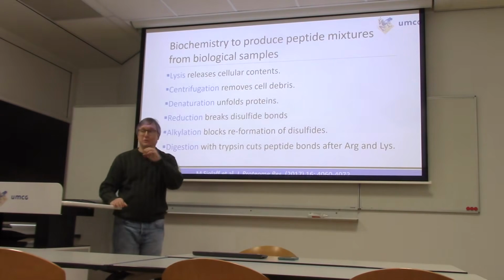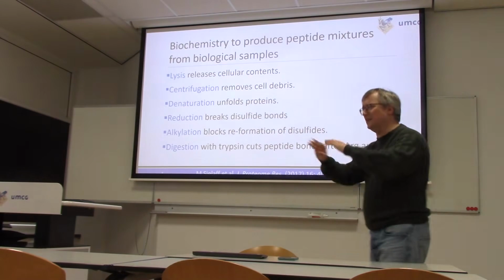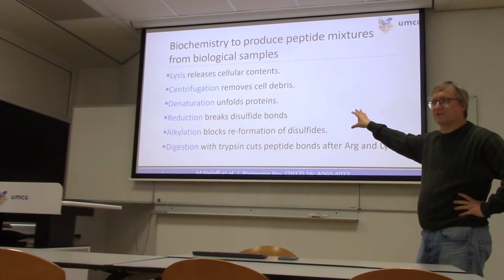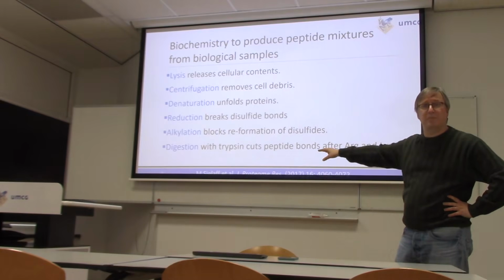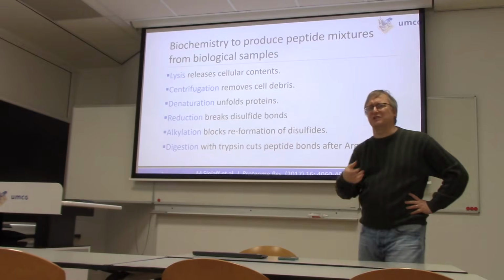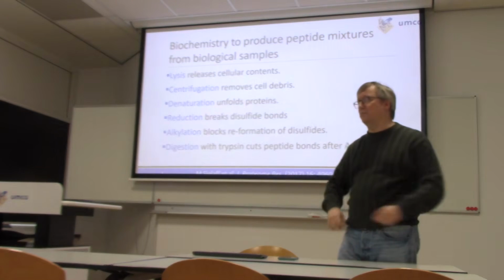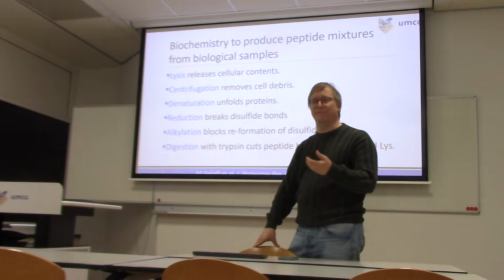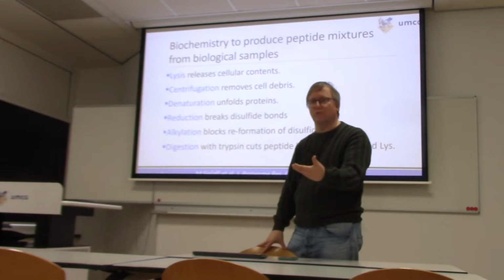All right. So that's the big picture of the collection, but I think it's useful for us to talk about this in a few more stages. So let's start with what kind of biochemistry gives us a sample that we can work with. Almost all of this is going to be about proteins until we get to the very last stage. So we have to do something to extract proteins from a biological mixture. If I have a bunch of cells that I've cultured, how much of their total weight is protein rather than something else?